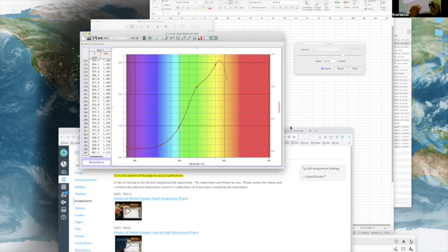It goes on repeat. So this right here is about 588, and that's what the computer looks at when it's doing the experiment, as it's monitoring the reaction.